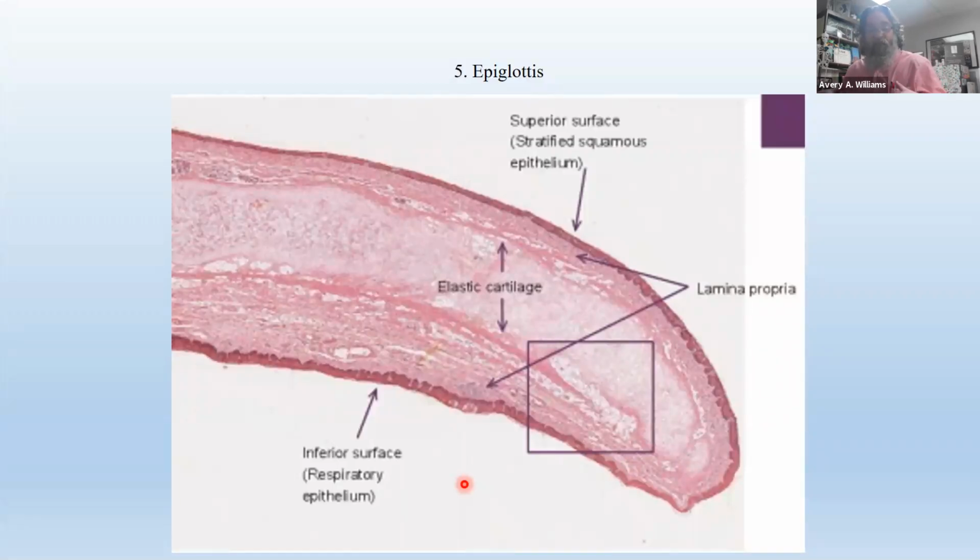And you'll see when we look at the lung and the trachea and so forth, it's the same type of epithelium, the respiratory epithelium, which is almost always pseudostratified ciliated columnar epithelium, and we usually abbreviate that PCC. So you got PCC here and stratified squamous epithelium here, but non-keratinized, right?